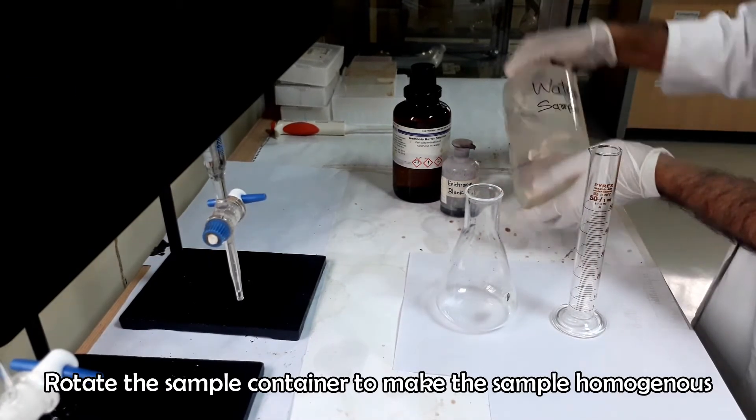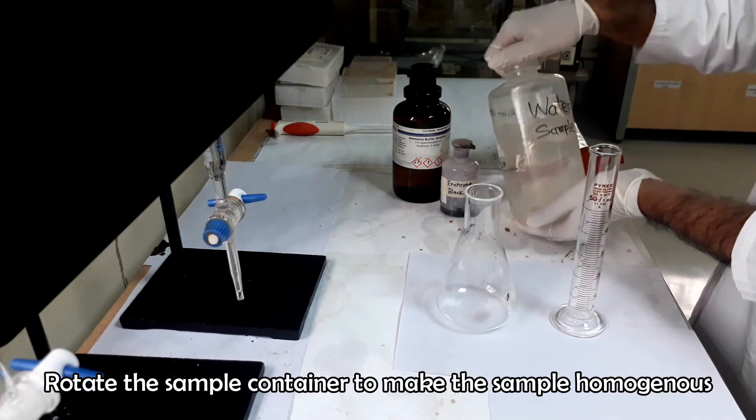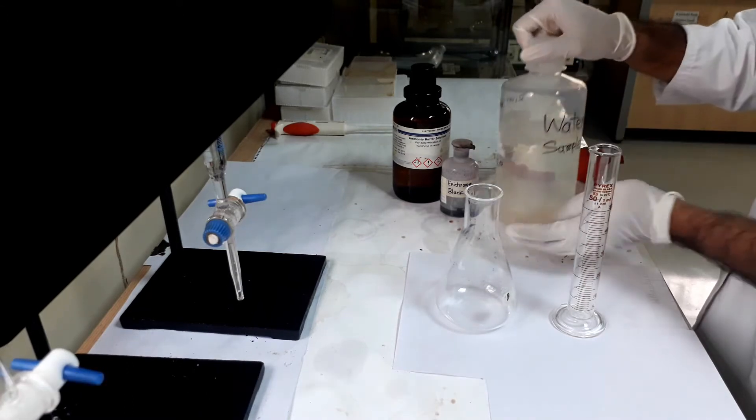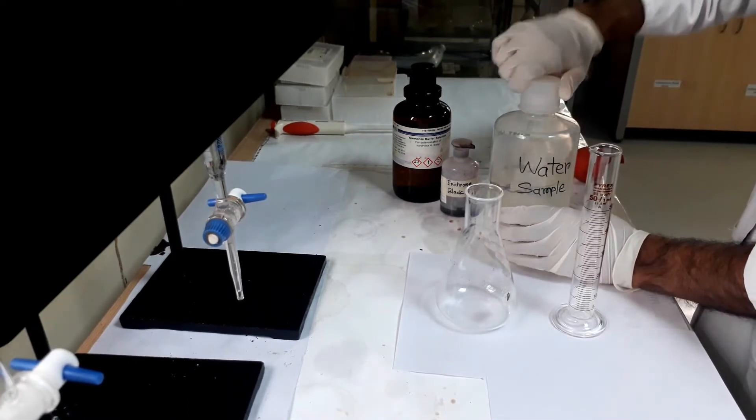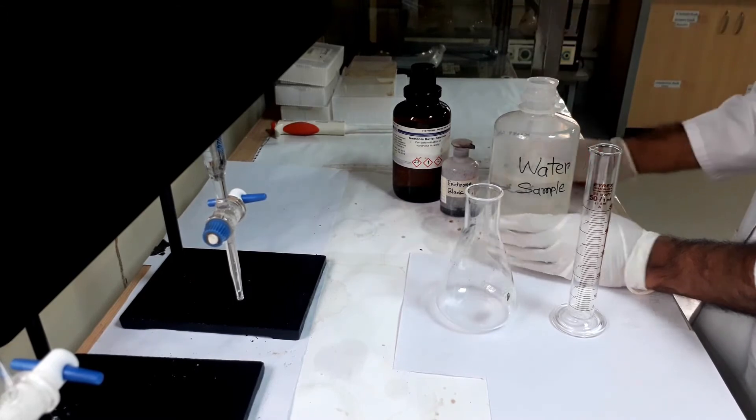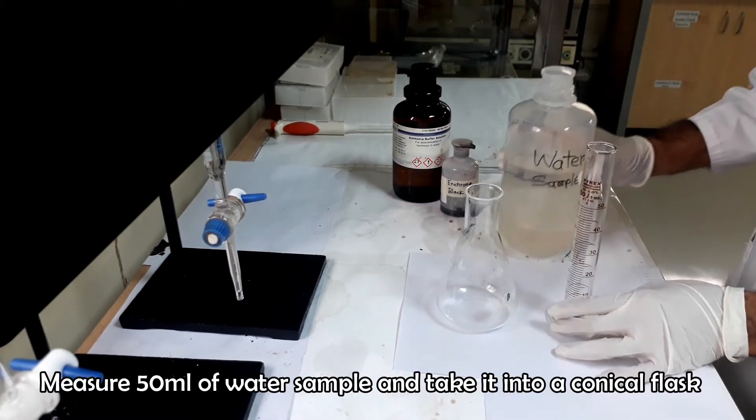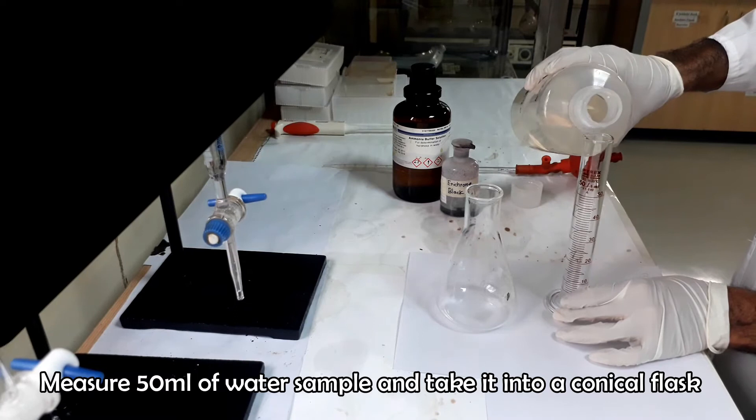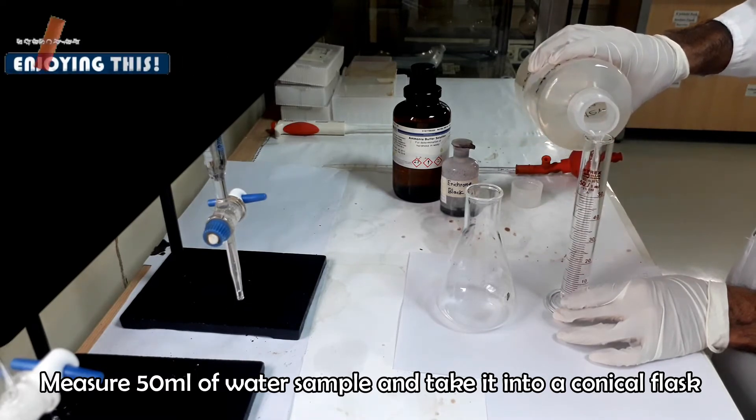Rotate and shake the sample container to mix the water sample homogenously. Measure 50 ml of water sample and take it into a conical flask.